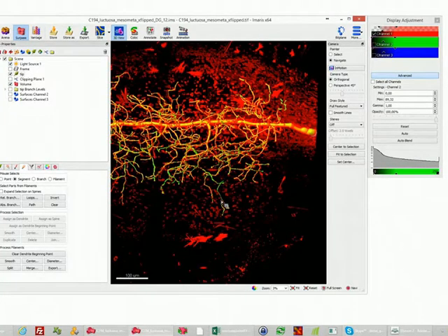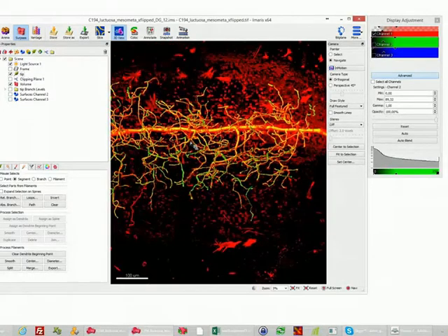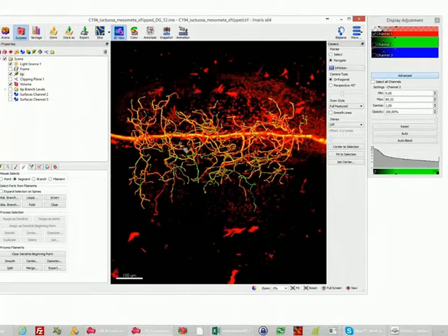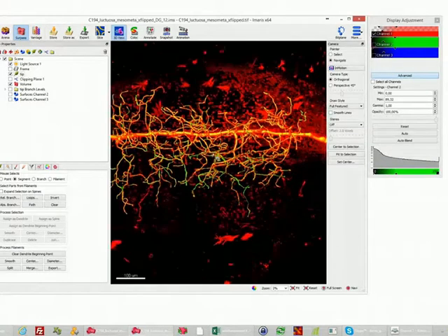And then these smaller spots are connected to the big spot by going through the brightest intensities of the data set. So with this way we get a vector. And the raw result will then be already quite good, but you would need to do some editing afterwards.